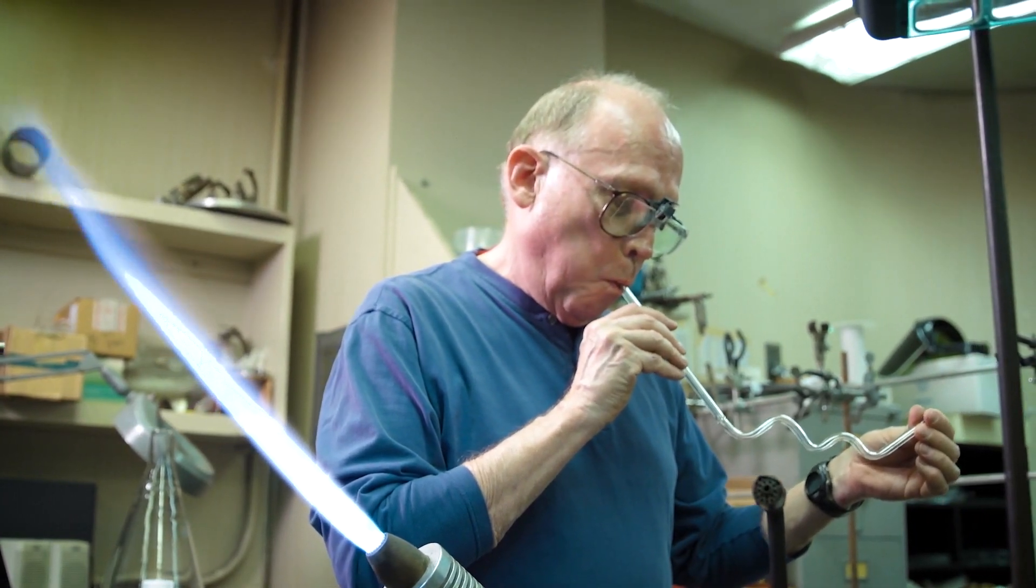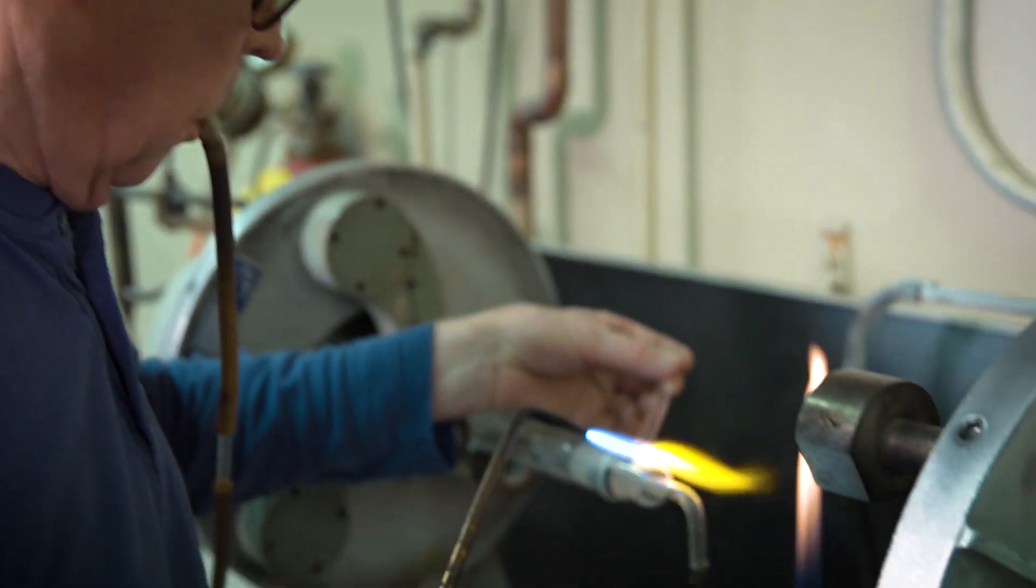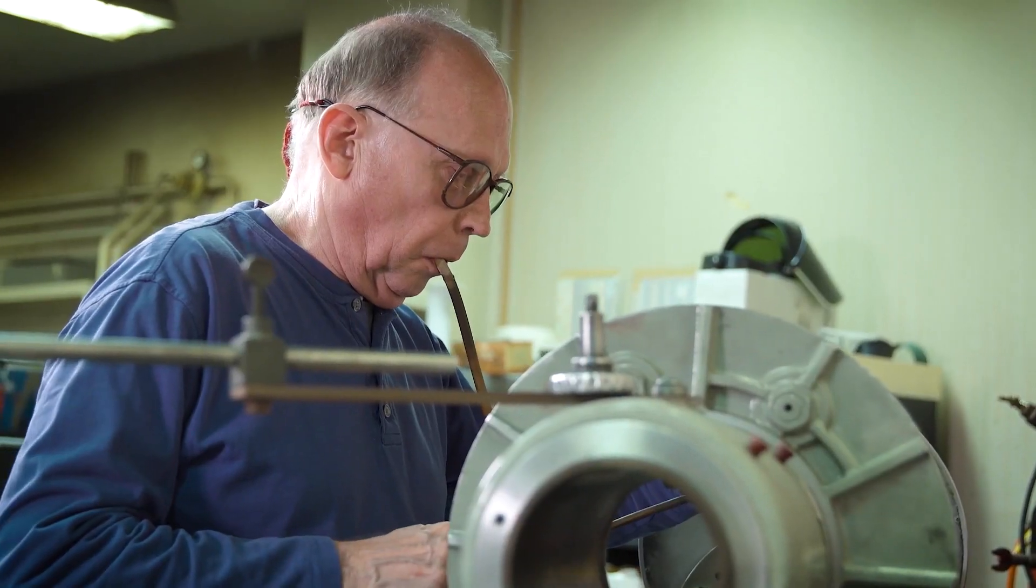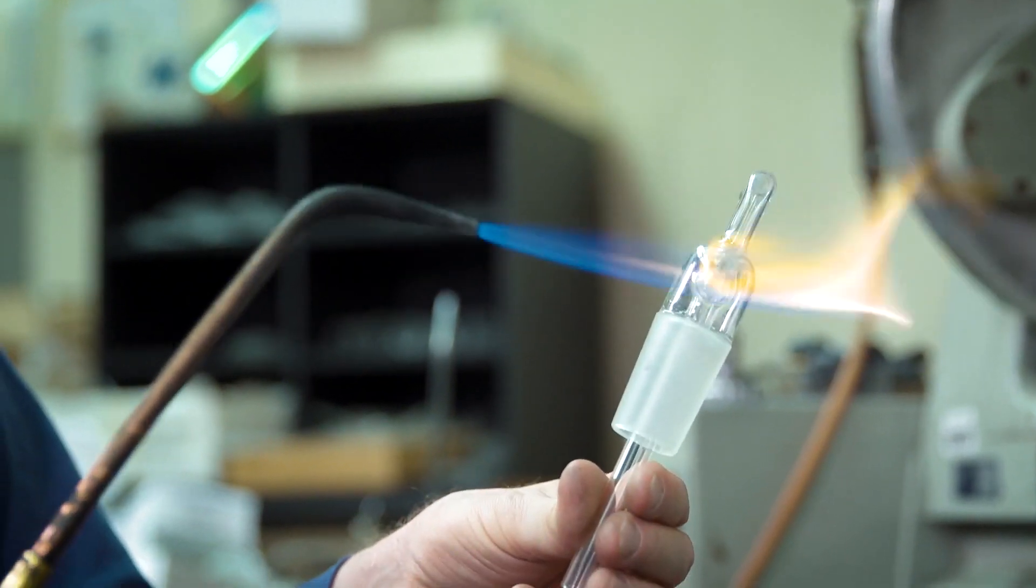Everybody at UC Berkeley wants the impossible. It's either something that's too small or too big. I never say no. I always figure out a way to make what the researcher needs to have. And it's up to me to extract out of their imagination something that I can make.